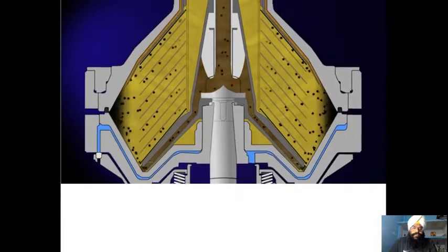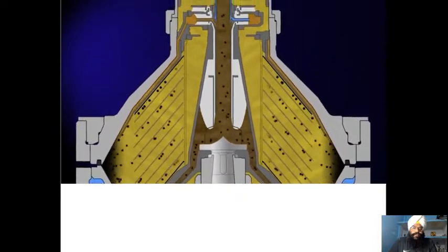Most of these solids were then removed through centrifugation, or by centrifuge, but the liquid that remained, the clarified lysate, was still rich in biological products, including dissolved chemicals, proteins, and other impurities. Amazingly, through purification, we can target a single protein within this biological soup.